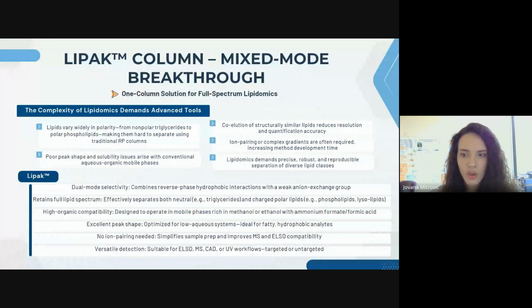On reverse phase columns, they may show very similar retention because the column doesn't interact with, for example, their polar functional groups. As a result, these very different molecules could coelute, making it hard or even impossible to distinguish between them.